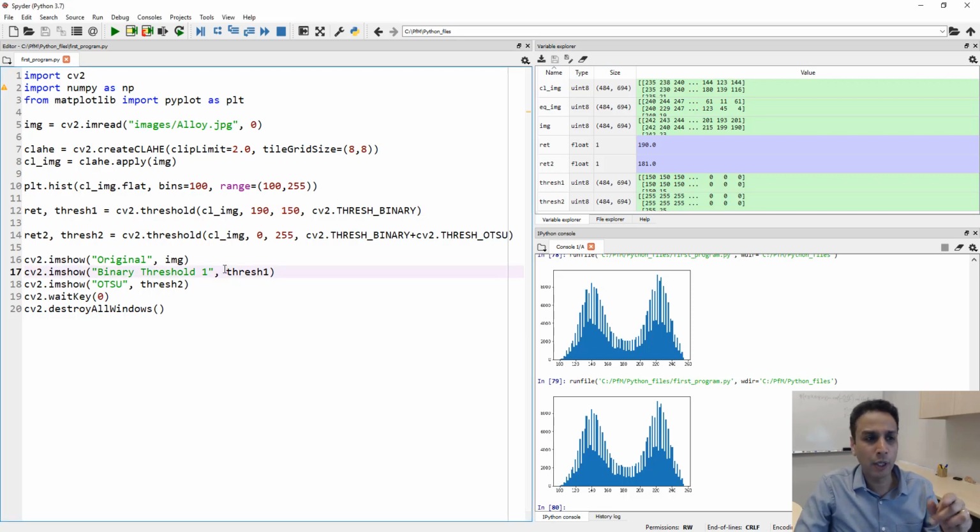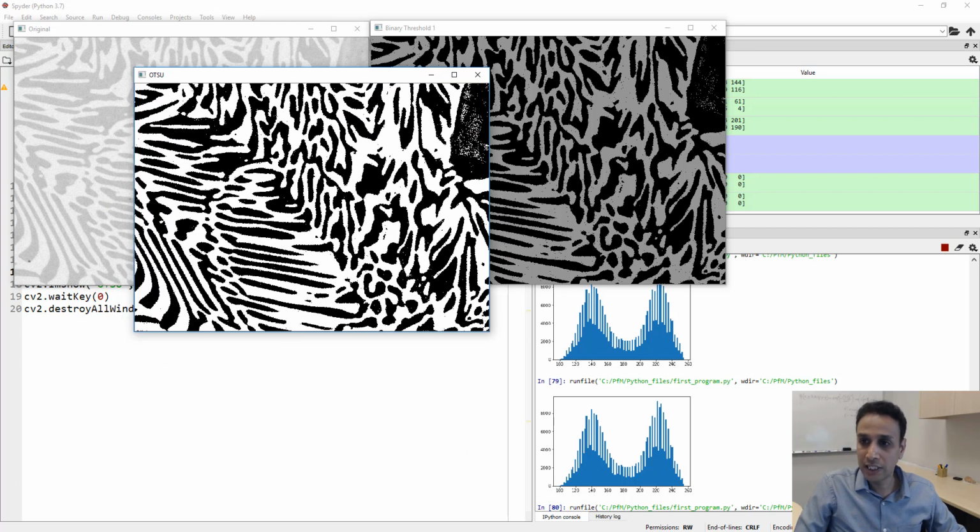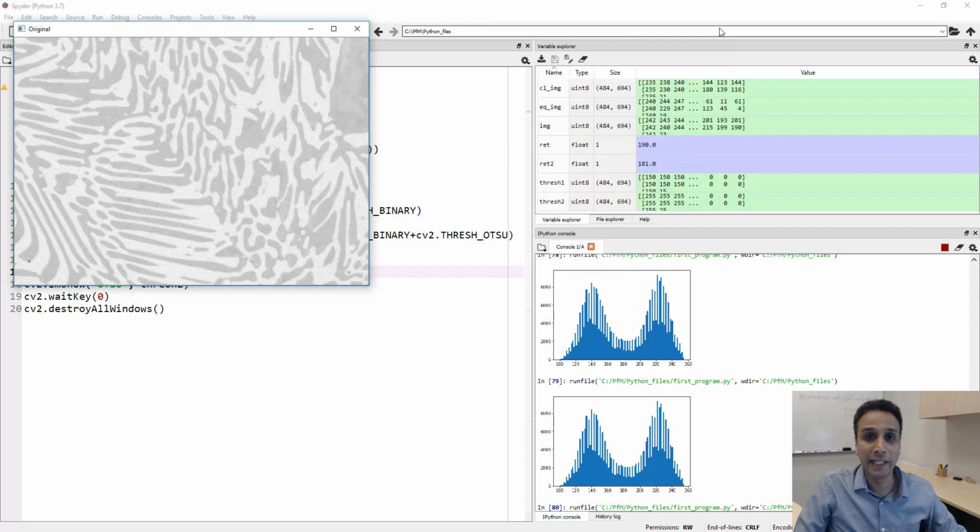One other thing: I have some notes here about what to show. It's already 18 minutes, so I'm not going to show this because I've already covered it in my previous topics. If your image is noisy, do not forget to denoise it first and then do all of this exercise. Otherwise, your life can get pretty difficult. Let me run this again. Otherwise, there will be a lot of salt and pepper, just like we see here, and your segmentation will not be ideal.